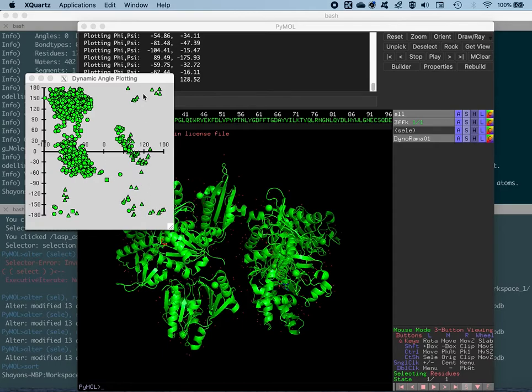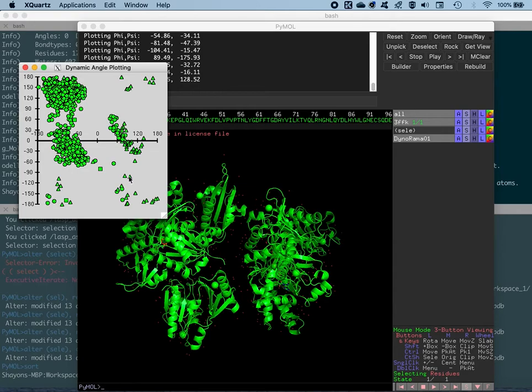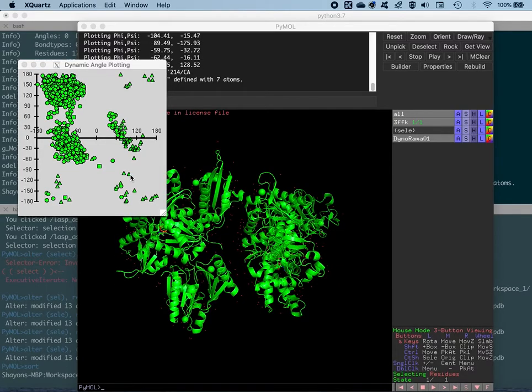Now let's have a quick look at the different positions that they might occupy. So let's pick one glycine residue from here. Let's say this one. Now, this is going to be a bit tricky, and you have to be very careful while picking this particular glycine residue, because if you click the left mouse button on top of this, it will try to change the phi and the psi angles according to your needs, even if you don't drag and just click on it. So never do that unless you're absolutely required to do it.